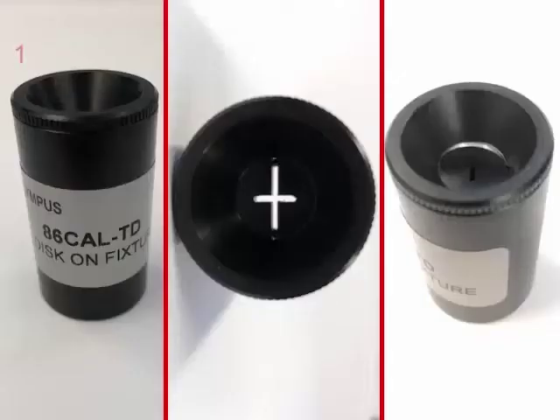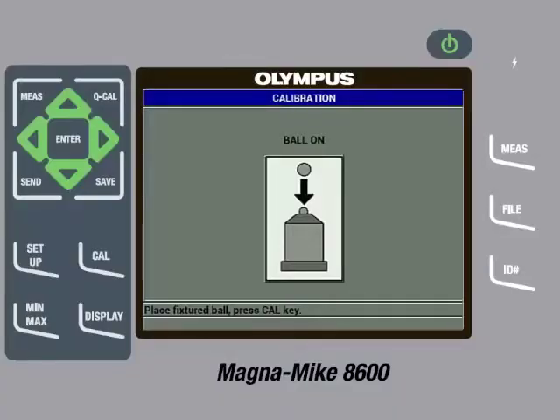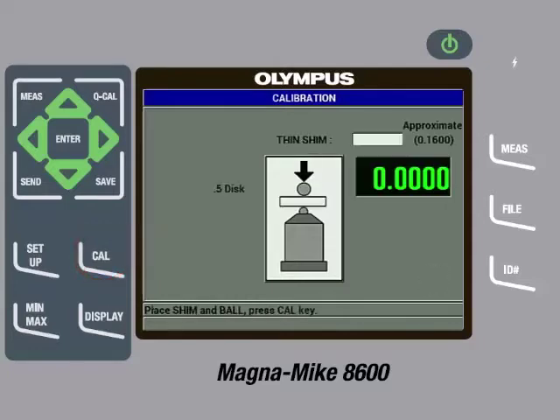To do this, take the 86-Cal-TD alignment fixture out of the calibration kit. Next, insert the disc target into the slot on the alignment fixture. If needed, force the disc through the slot a few times to ensure that it will not get caught on the sides of the slot. Then place the disc and fixture on the probe, making sure to align the disc perpendicular to the chisel tip edge. Then gently pull down on the sides of the fixture to ensure the disc is in contact with the probe tip. Then press the Cal key. After processing, the gauge will display a zero value.